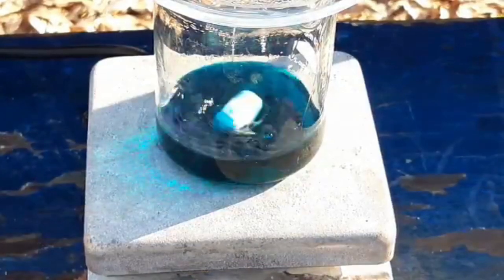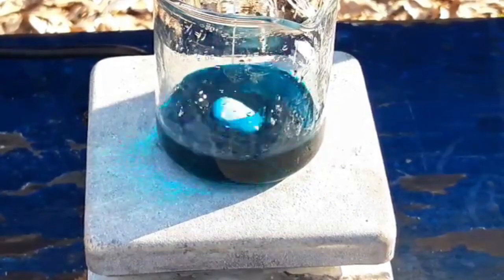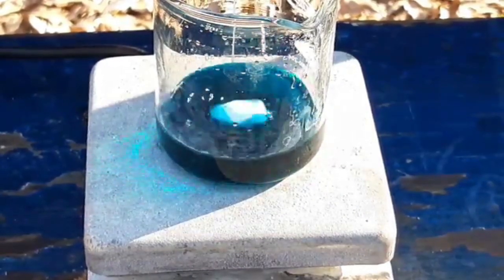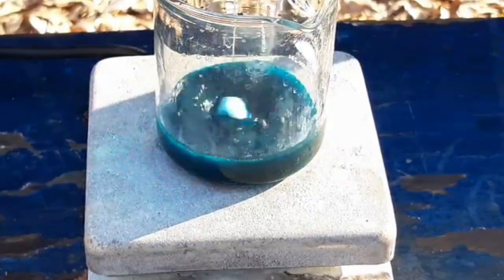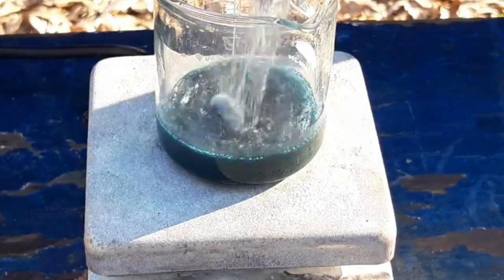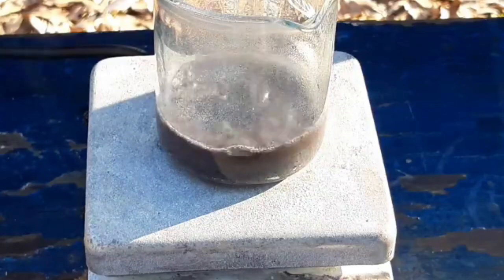All right, chem peeps. Our copper acetate has dissolved in our glacial acetic acid. Here goes nothing. Maybe it's not as bad as I was worried about. I've got some gas generation — okay, there we go. Copper is being deposited.